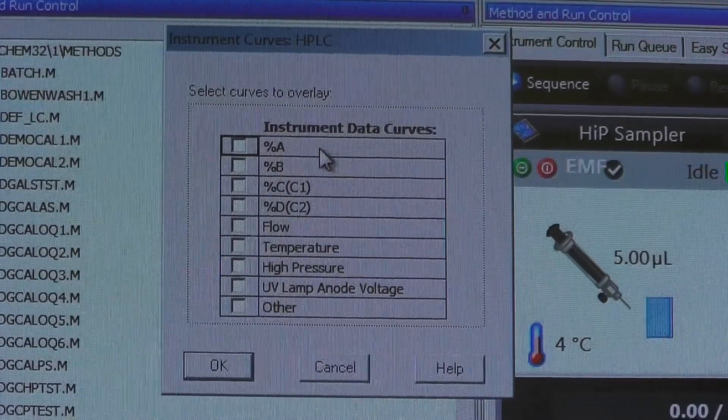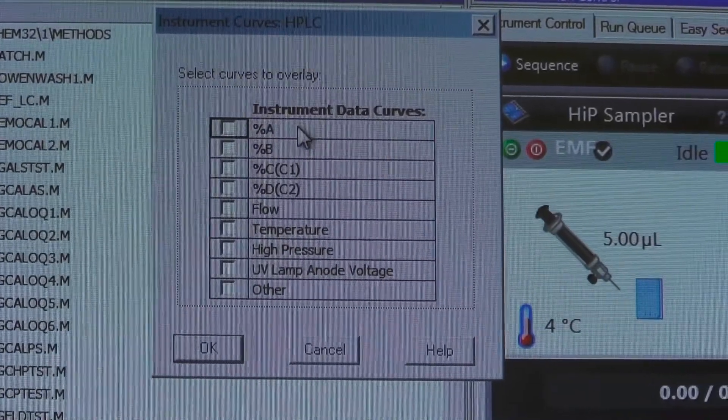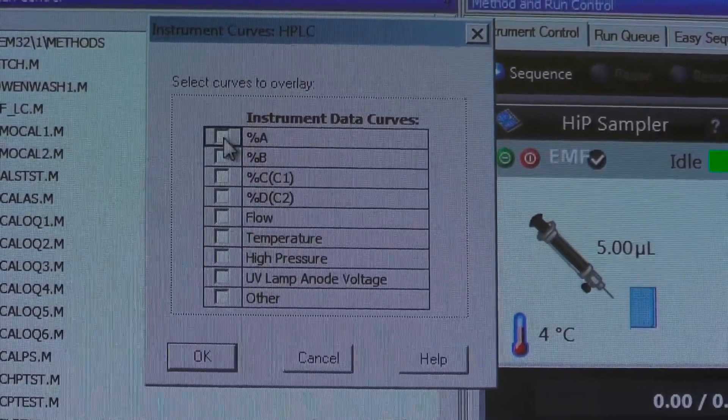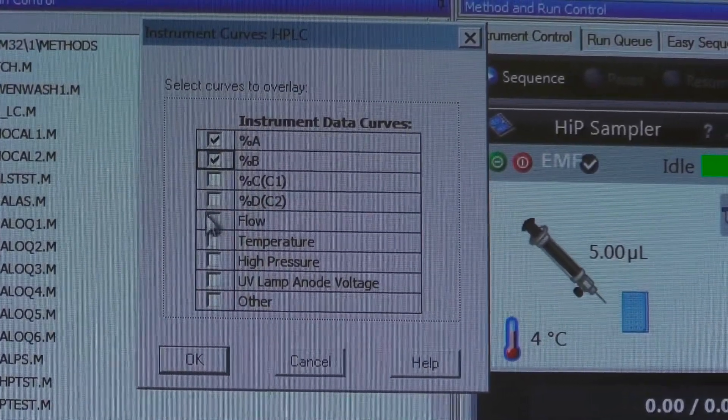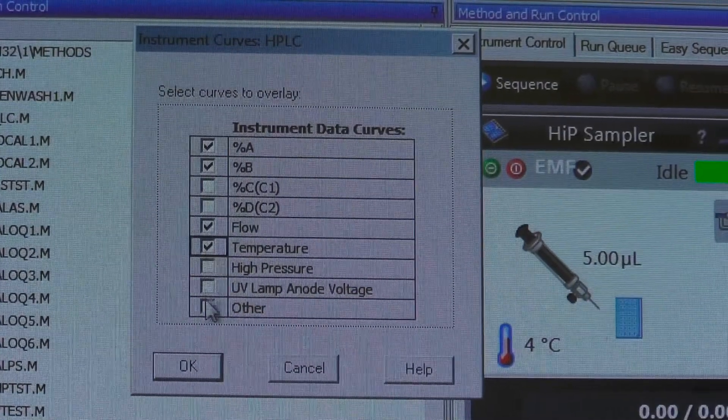This time, an Instrument Curves HPLC window will appear. Select all the Instrument Data Curves you need for future analysis. Click OK.